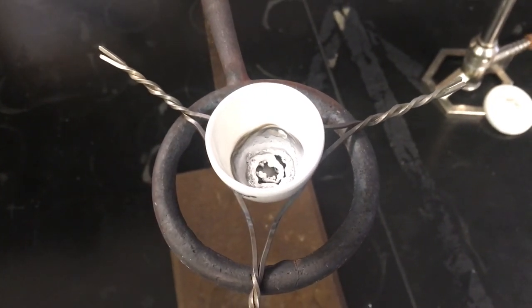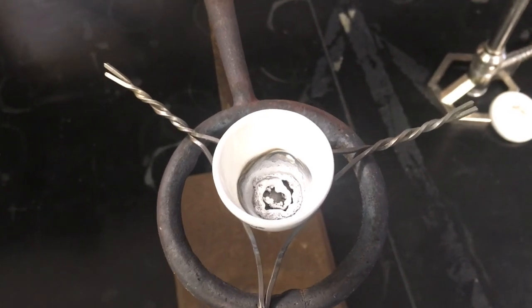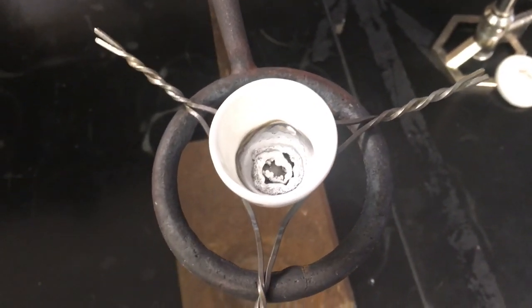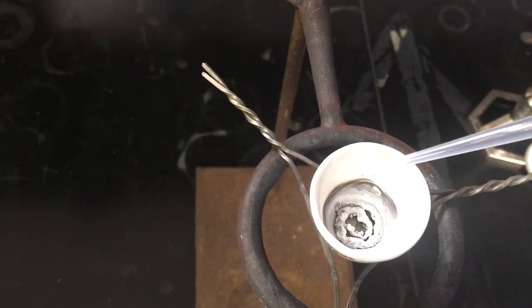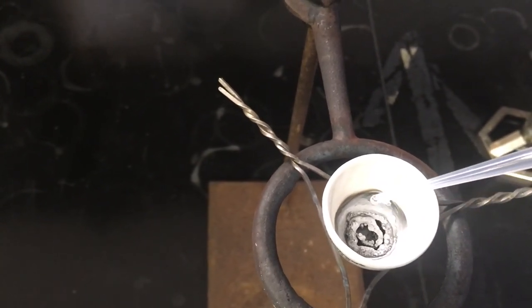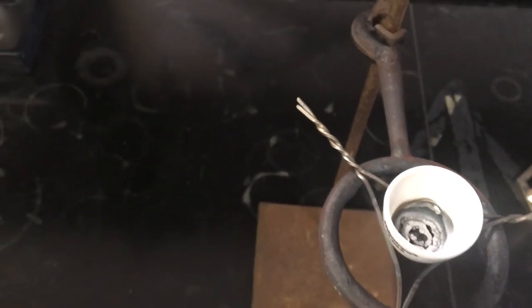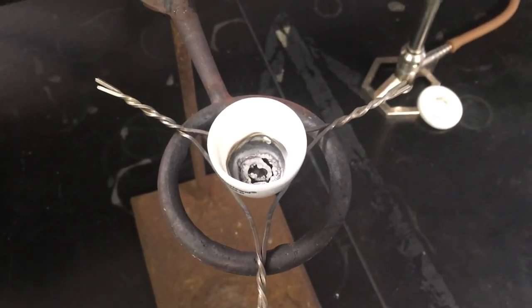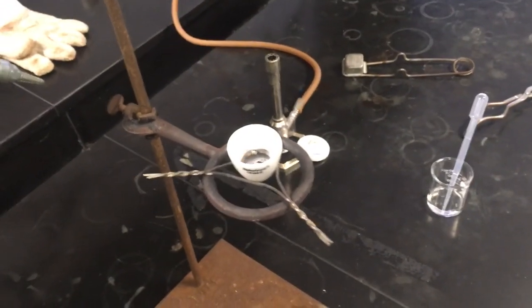Looking down at the magnesium ribbon from the top, it's no longer the thin wire shape — it's all white and gray and crusty, which is good, meaning everything burned as intended. I'm now going to add about six to eight drops of water. The sample looks like it may still be slightly warm, but you can see the water is not evaporating right away, so that should be sufficient.